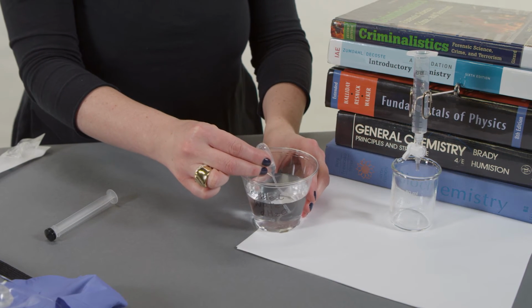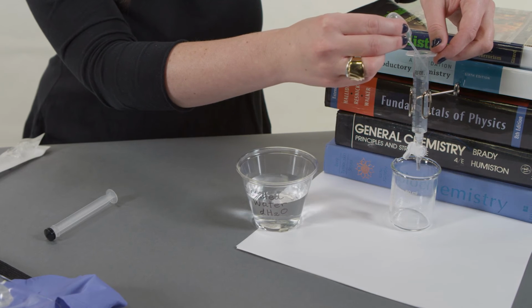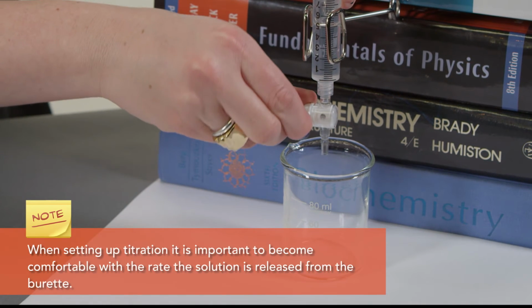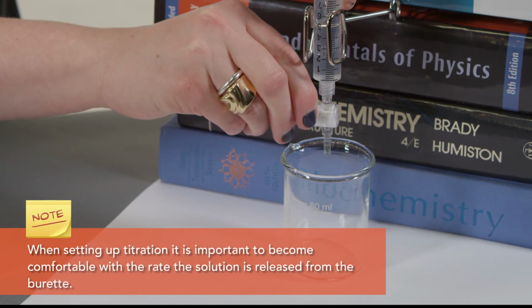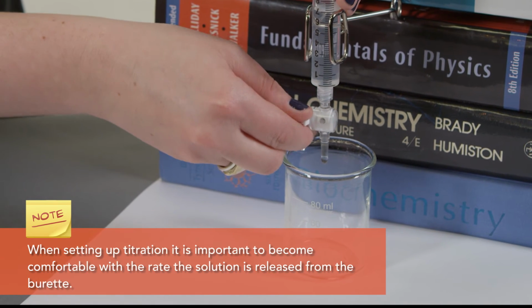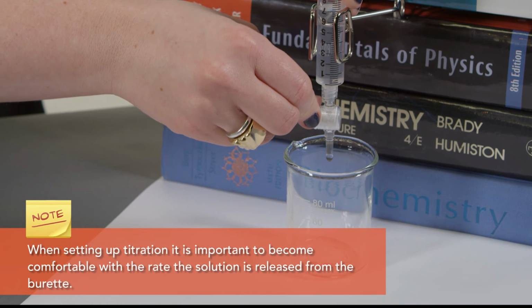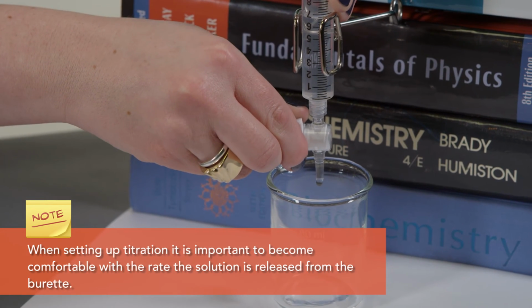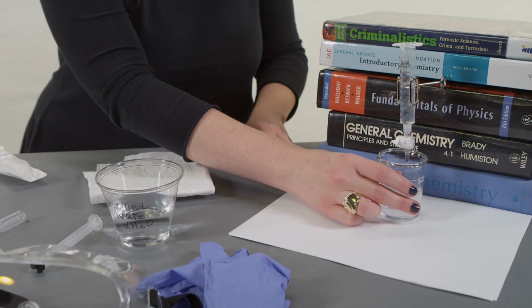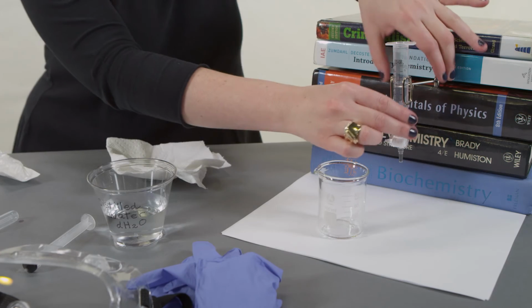Use the pipette to fill the burette with 7 to 9 milliliters of distilled water. Using both hands, one hand on the burette and one hand on the stopcock, practice releasing water from the burette into the beaker. When the open circle is facing you, the burette is closed, and when the open circle is directly under the spout, the burette is open. When you're comfortable using the burette, pour the water in the beaker down the drain.